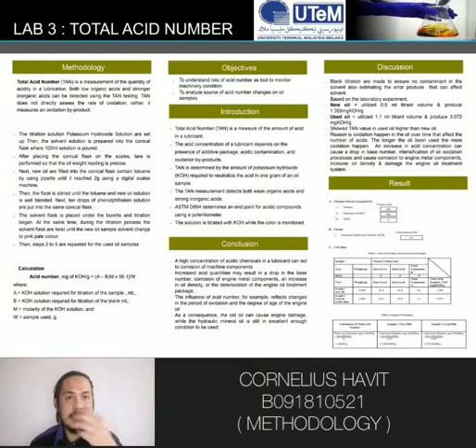In this second step, we must do it carefully because the presence of oil will affect the weight of the new oil, because the digital scale is very sensitive. Even the presence of oil will affect the weight. Next, new oil is filled into the conical flask containing toluene by using the pipette until it reaches 2 grams on the digital scale machine.